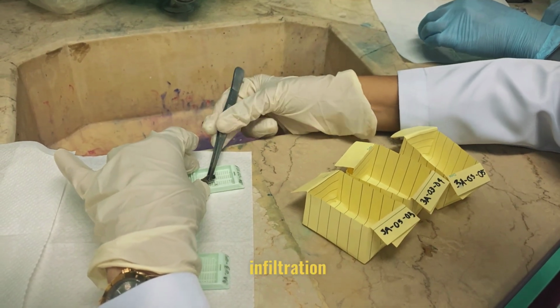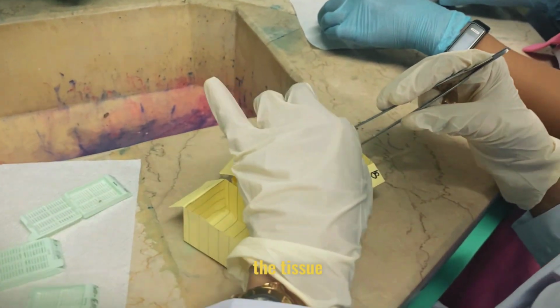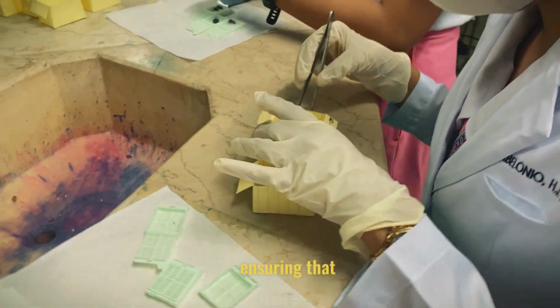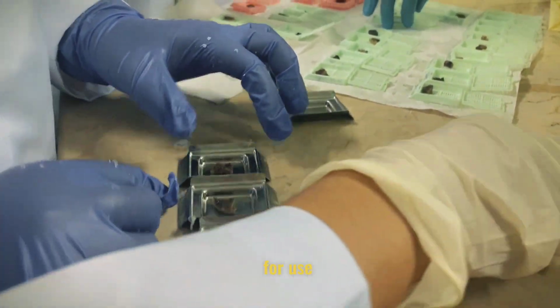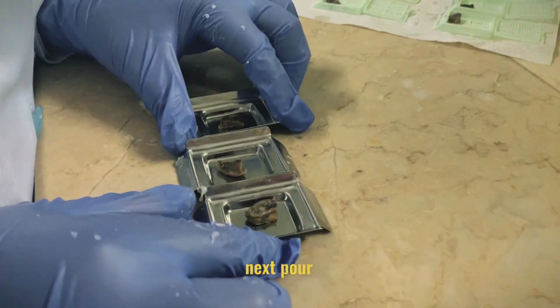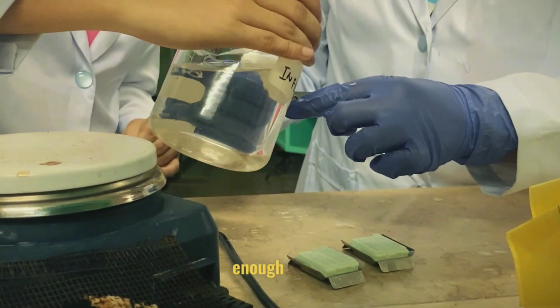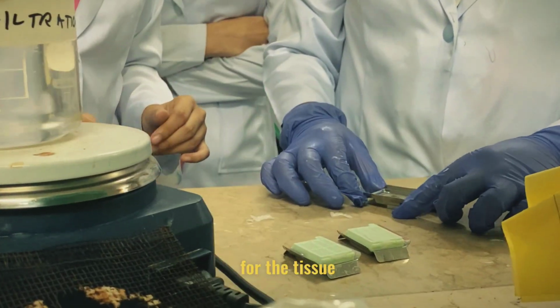After infiltration, we will embed the tissue. Begin by preparing the embedding molds, ensuring that they are clean and suitable for use. Next, pour in the molten paraffin wax, filling the molds to provide enough support for the tissue.